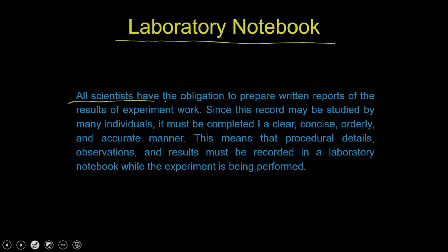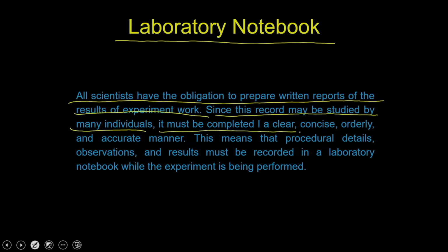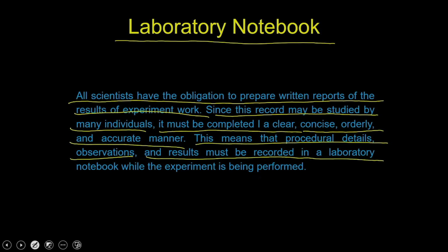All scientists have the obligation to prepare a written report of the results of the experimental work. Since this record may be studied by many individuals, it must be completed in a clear, concise, orderly and accurate manner. This means that the procedural details, observations and results must be recorded in a laboratory notebook while the experiment is being performed.